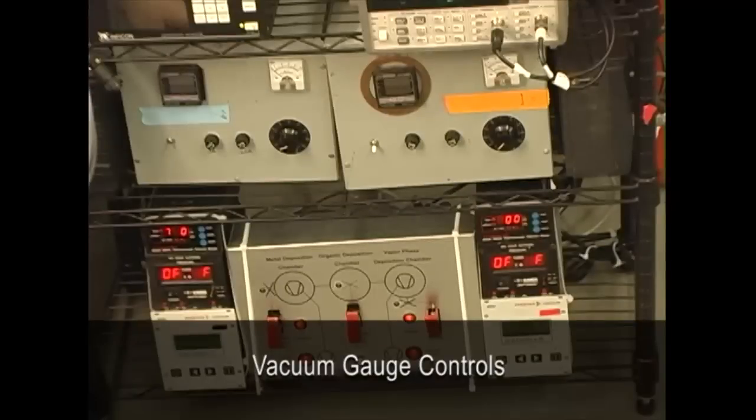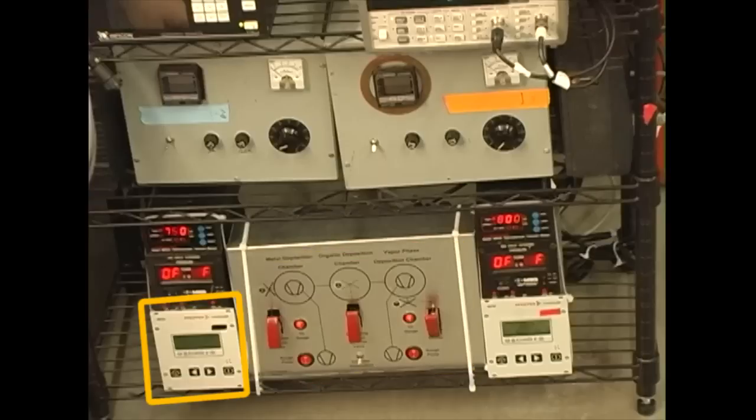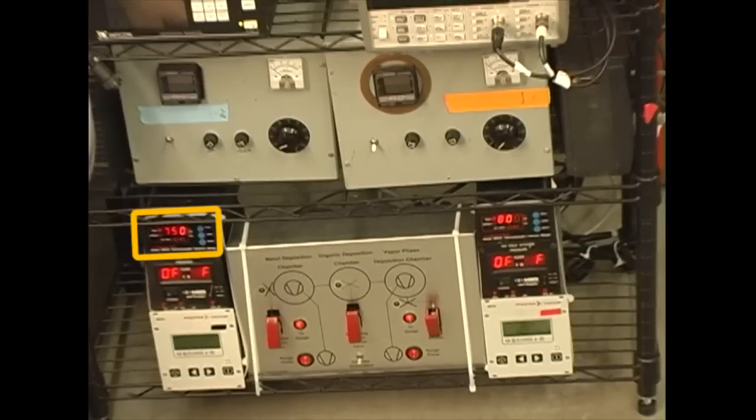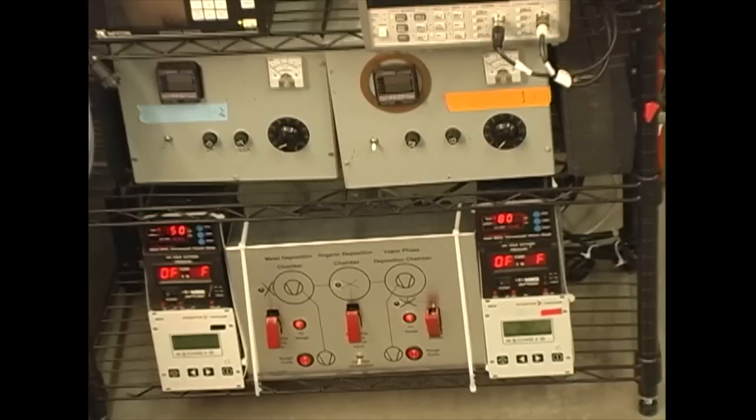This is the control center for building the devices. This switch controls the vacuum pumps - first a rough pump and then the turbo vacuum pump. There are two different vacuum gauges for low vacuum and high vacuum. At the next level is the temperature control for organic deposition.